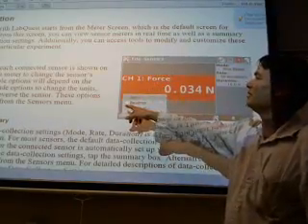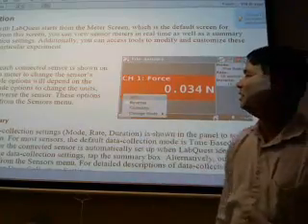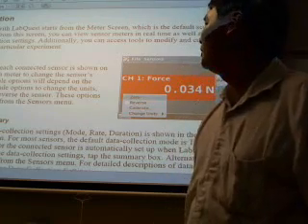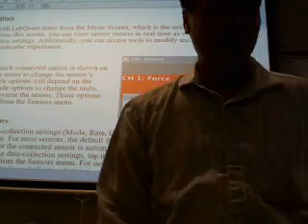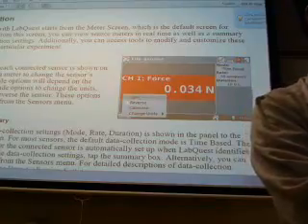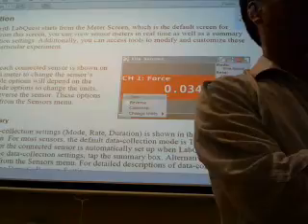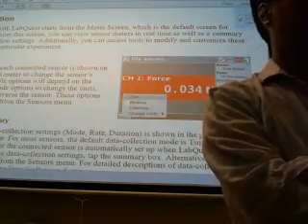Digital meters for connected sensors are shown on the screen. Tap on a meter to change the sensor settings. So let's tap on a meter and change the sensor settings. What can we do? We can change it to Kelvin.